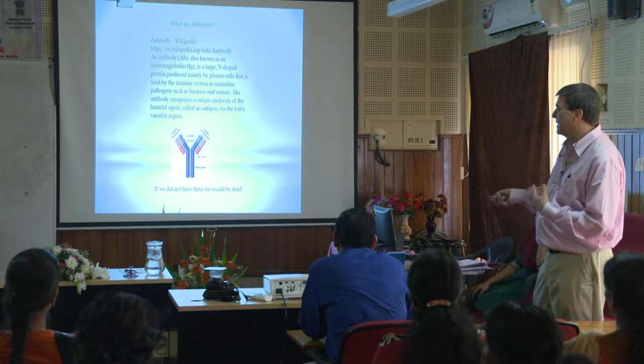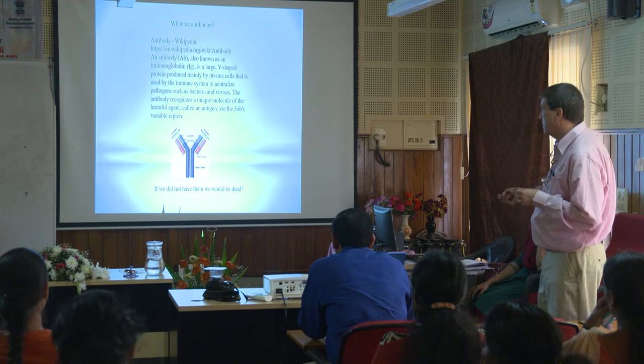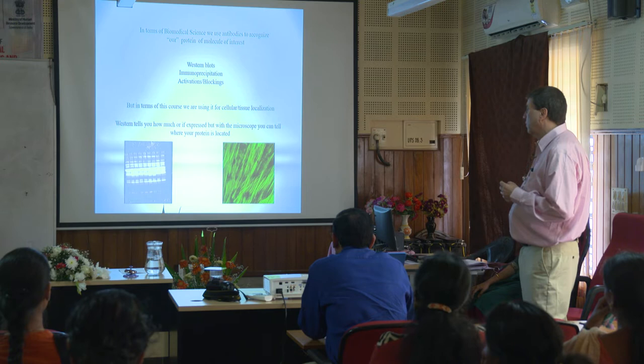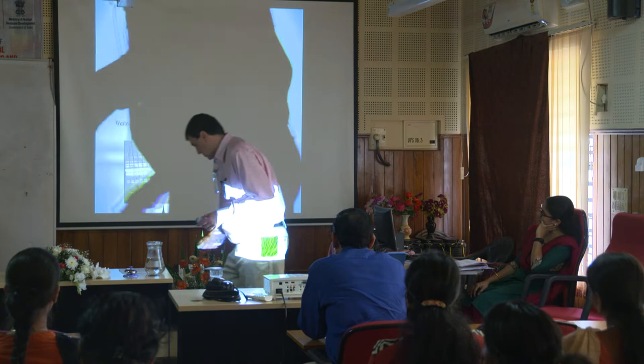And like I said, somewhere along the line, somebody realized, hey, we can use this to our advantage in terms of measuring biology, because antibodies are absolutely fabulous at recognizing three-dimensional structures. So what we're going to use it for, obviously, is to recognize our protein or our molecule of interest. So what is a protein, right?